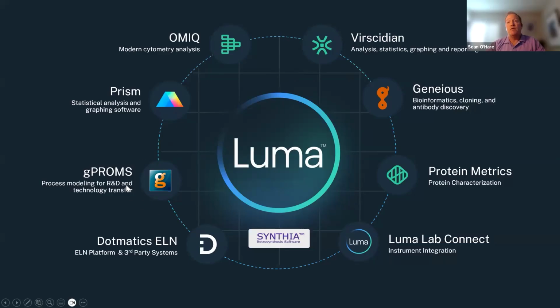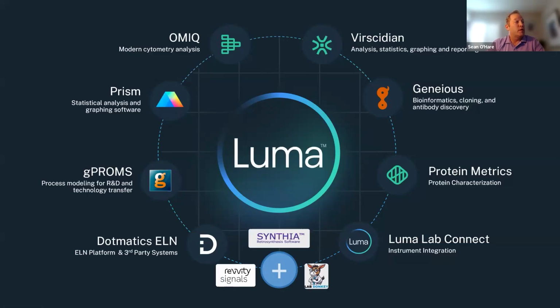GPROMS is a new one to many of you, perhaps. This is something that comes in with our recent acquisition by Siemens, and this allows complex modeling in the pharma space for things like solubility and polymorph screening. Let me build this out one more. The bottom here is a plus sign that indicates our open platform and ability to integrate with other third-party tools. So Synthia is a retrosynthetic tool brought to us by Merck KGaA. LabDonkey is a lab scheduling tool, and Revvity Signals is a competitive ELN. So we're agnostic to what we can connect with and orchestrate workflows across.